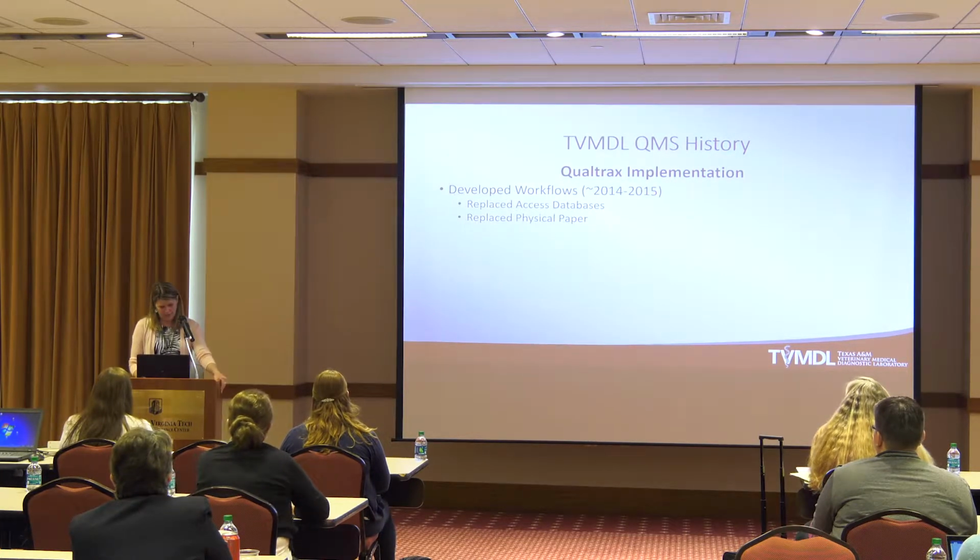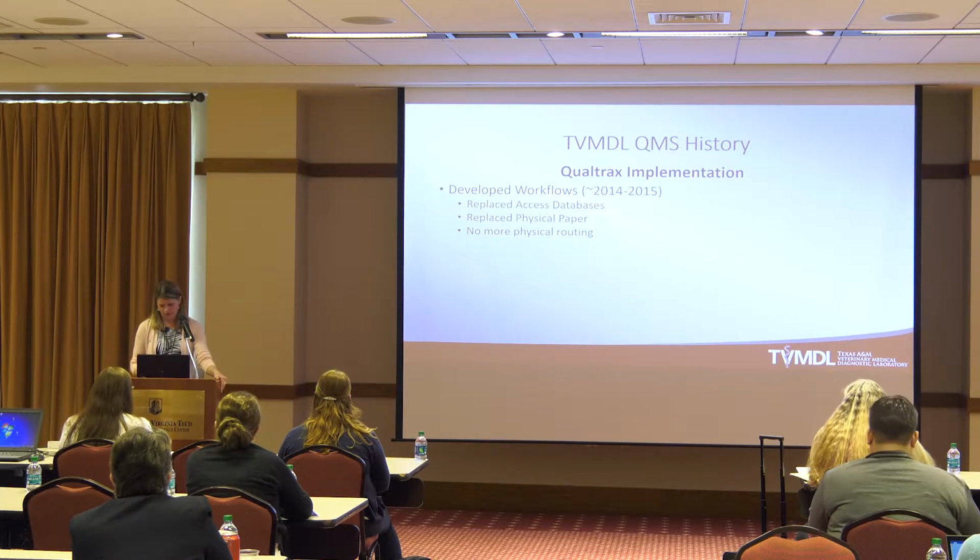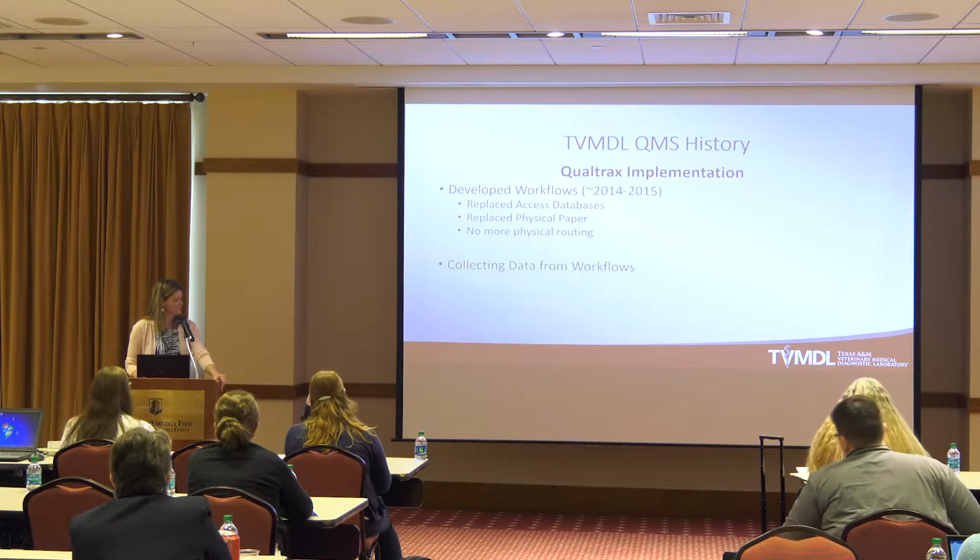So it replaced the physical paper. In this day of paperless initiatives, our management definitely thought that was a good idea. No physical routing. We had folders, had documents in there with posted flags. We had student workers that just carried folders around the building to get people's signatures. Probably sounds familiar to some of you, so the fact that we don't have that anymore was just great.